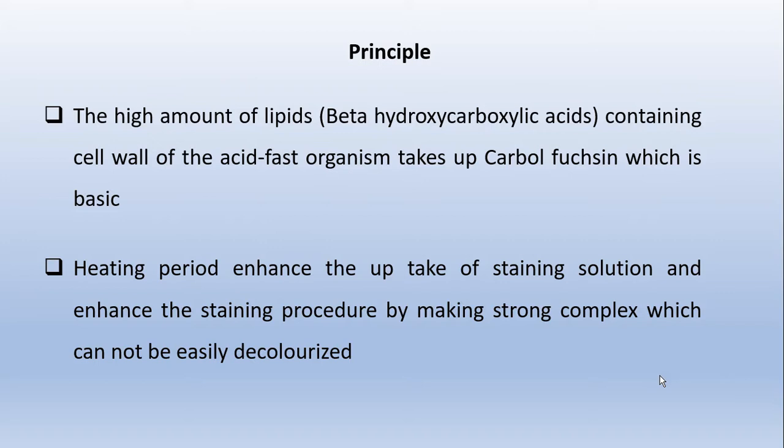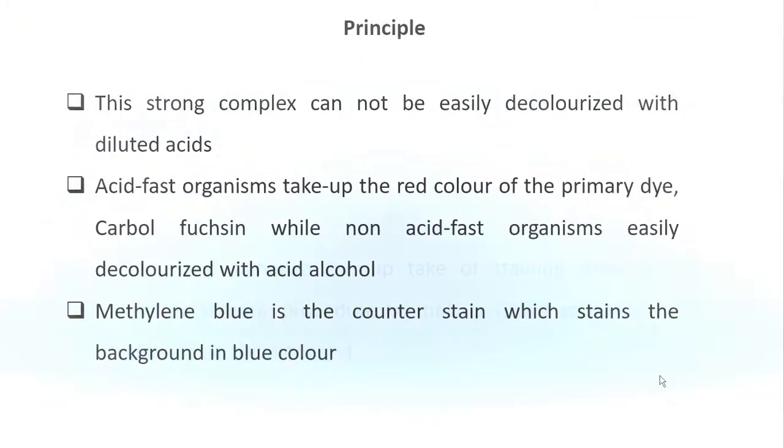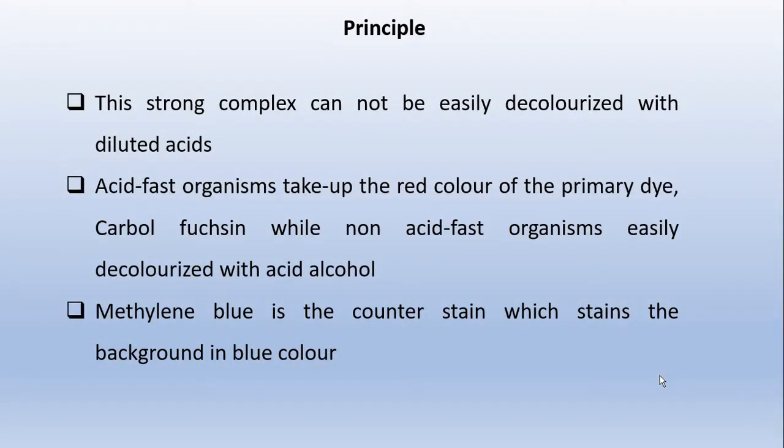The heating period enhances the uptake of the staining solution by making a strong complex which cannot be easily decolorized with diluted acids.